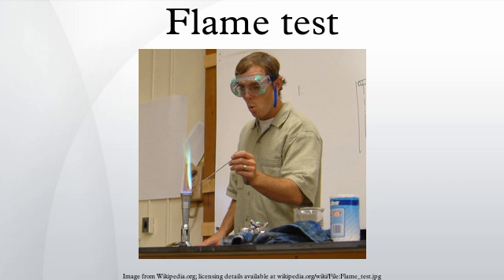The flame test is relatively quick and simple to perform, and can be carried out with the basic equipment found in most chemistry laboratories. However, the range of elements positively detectable under these conditions is small, as the test relies on the subjective experience of the experimenter rather than any objective measurements.